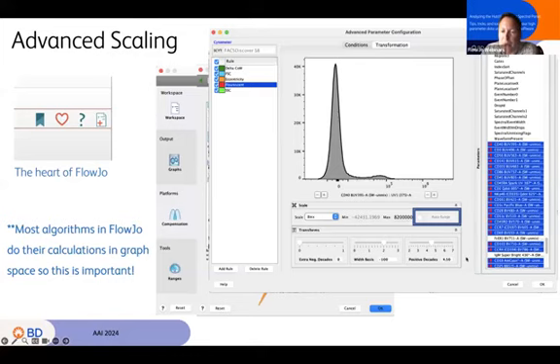Okay. Also, there is an auto range button here. So I put the little box around it there. You can check that box for any one of the parameter rules that you've got. And what that will do is automatically attempt to set the best possible range for that parameter. It is not on by default because, the caveat, it will pick whichever sample you have first in your list and use that to set this range based on.